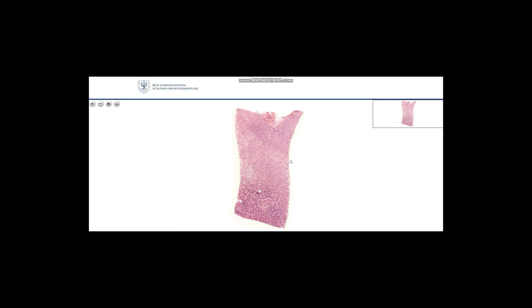Hematoxylin stains the basophilic cell organelles like ribosomes bluish-purple — we call these basophilic structures. Eosin mostly gives a so-called neutrophilic staining, which is a pale pink. Sometimes some structures will stain better with eosin and appear more red — we call those structures eosinophilic or acidophilic.